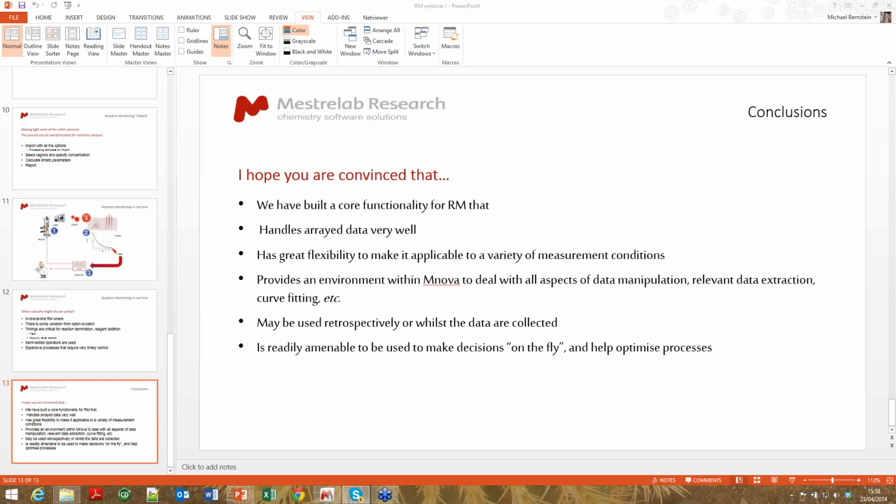kinetic data. As I said, if you have something that grows in concentration and then goes away, an intermediate that's formed, for example, then that would not be applicable with the 3-parameter fit. It is a good fitting function. How do you know which function to choose? I guess you have to eyeball it and see whether the 3 parameter is going to work for you, and if it doesn't, then you'll have to export the data and use some other software, whether it's Excel or something more elaborate to look at the data, to look at the fitting.